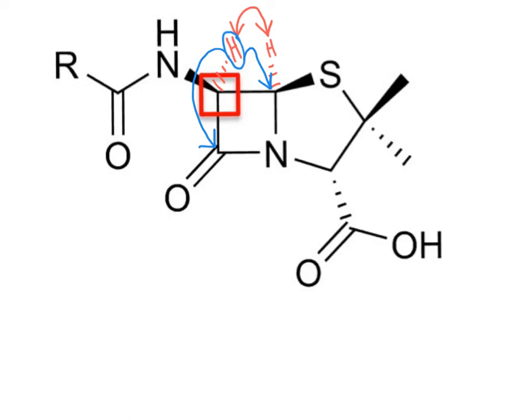Do not draw an arrow to the carbon that's directly connected, so don't draw this arrow that I just showed here. That would not be correct because that is a heteronuclear single quantum correlation, not multiple. And we want to show the multiple ones here. So we should go to here, which is 2 bonds, and here, which is 2 bonds as well. And then thinking about 3-bond correlations, because HMBC can go out to up to 4 bonds.